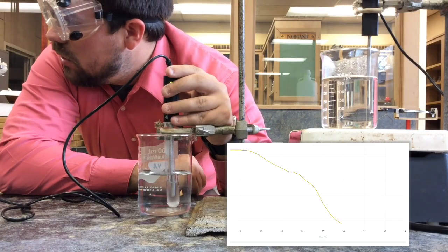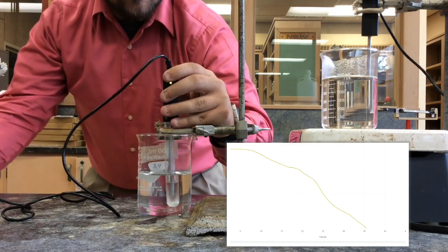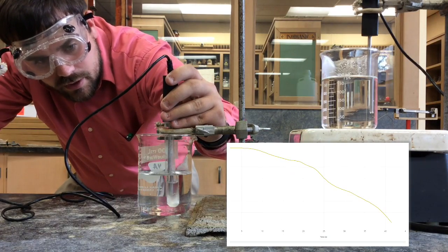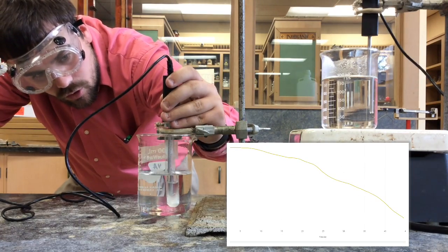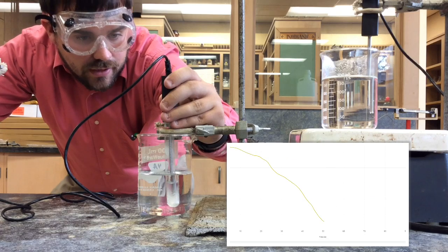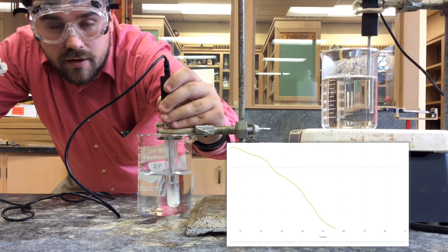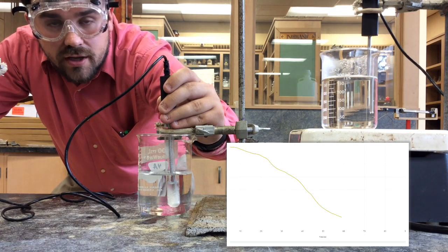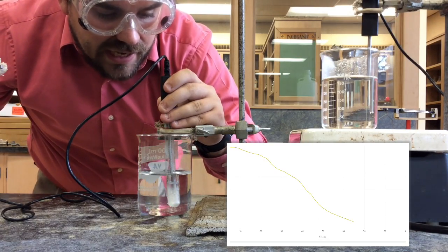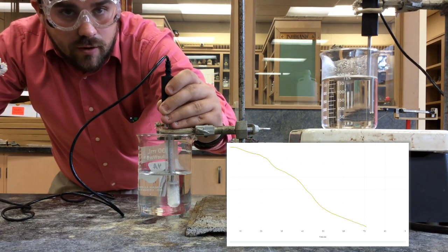And so we're waiting, and the temperature is dropping pretty rapidly. If I can make sure that I'm holding it steady and looking at my computer at the same time, I'll read off temperatures as I go. Now, I wouldn't want to hold on the side of the glass because what you're observing right now, or should be observing, if the camera's good enough, is the white solid starting to form. It's going to start forming on the outside of the test tube first because that's where the cooler water is coming in contact with the glass. And so while you see white stuff on the outside right now, the inside is still pretty liquidy. And so we're observing pretty much the transition from the liquid to the solid state.